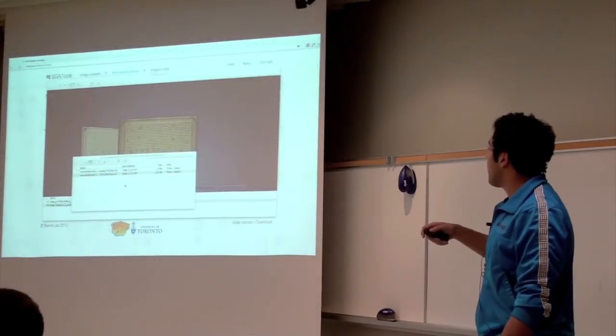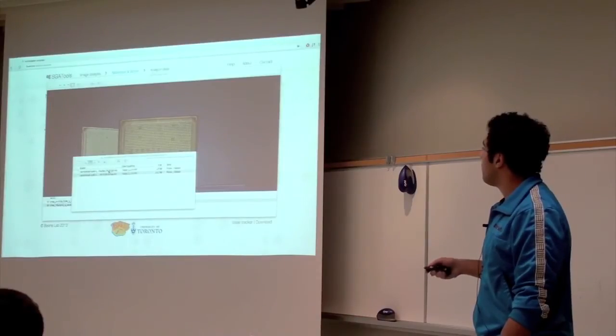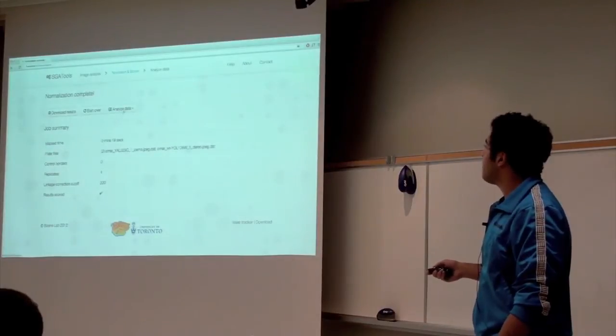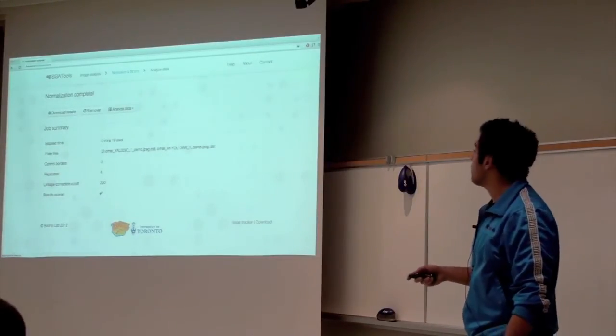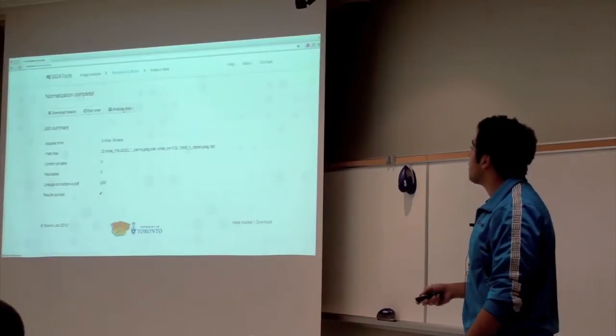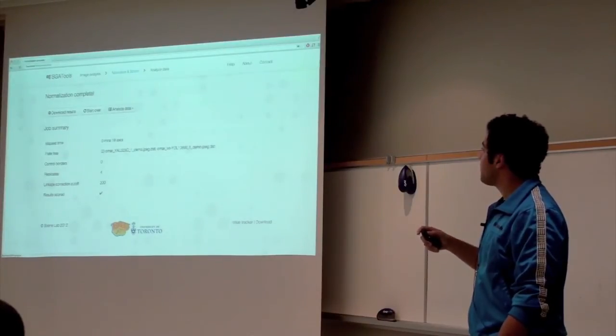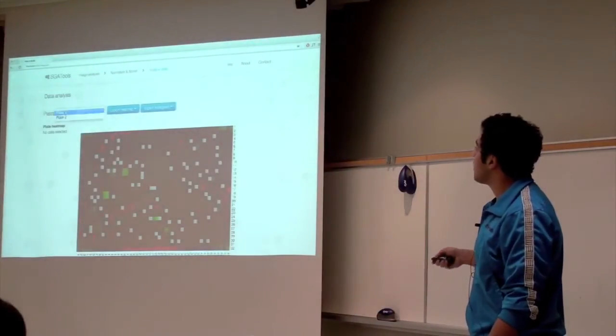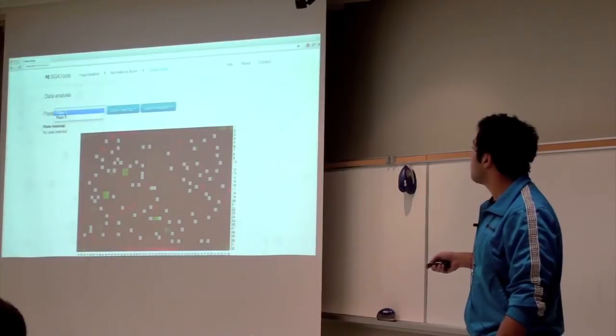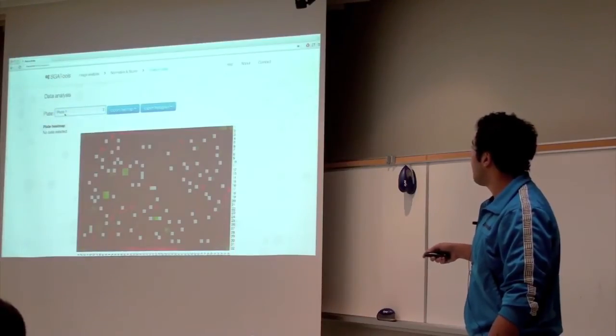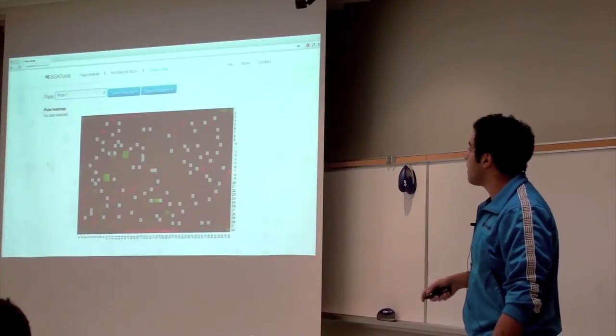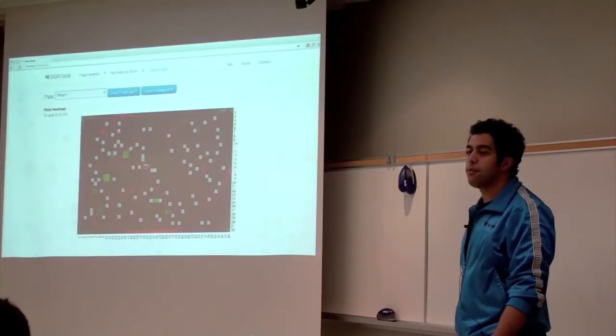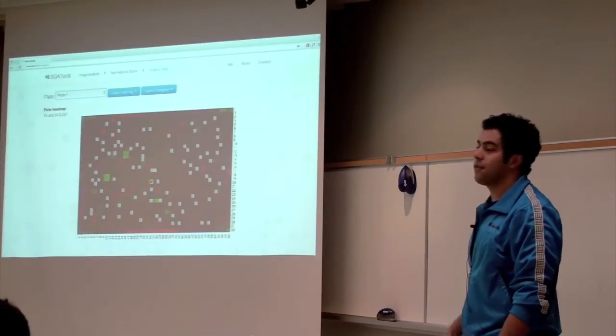Another thing you can do with the web app, once you're done here, you can analyze the data. So we've added a visual component to the web app so that you can kind of look at your screens and see what's going on. So we're just going to go ahead and click on that. It's going to direct you to another page with your data loaded in. You can take a look at the heat map of the screen that you have. You can select different plates, hover over the plate and look at the different scores that you got back. Just visual inspection for the results that you have rather than just looking at the spreadsheet.